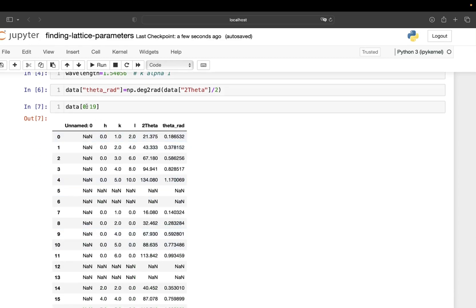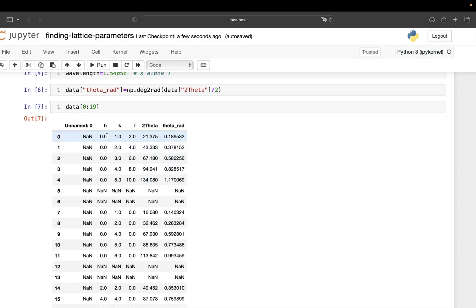I can filter out which rows I want to see — for example, rows zero to four. You can see that h is always zero, meaning these planes are 0kl. And if you look carefully, l is always two times k, so in short these are 0k(2k) planes.